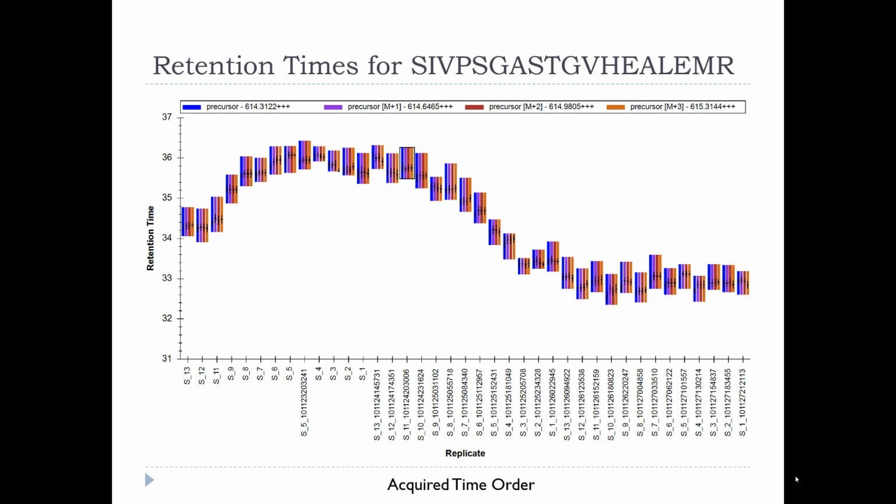I bet they didn't just cycle right to S13 again, but they're acquiring it in 3 different cycles, right? So that's actually blocking, and that's the way you want to do things if you're doing 3 different calibration curves. But what really happened to the chromatography? Like this is fine. Anytime I see that the peaks are overlapping, I'm like, okay, that's kind of what I expect from chromatography.